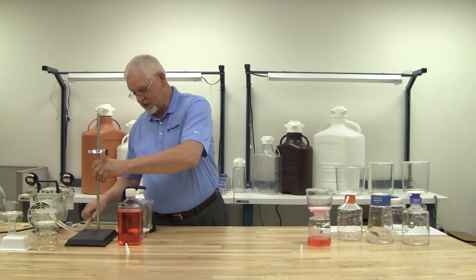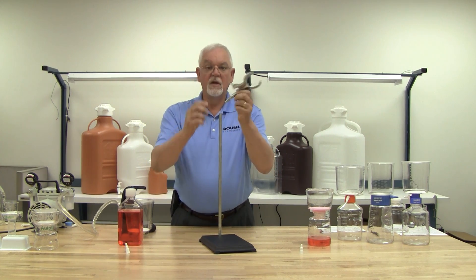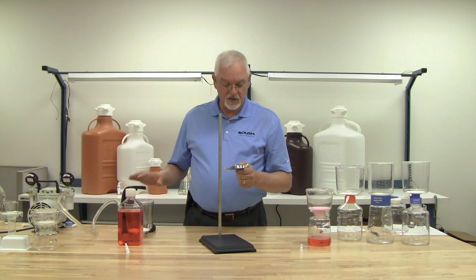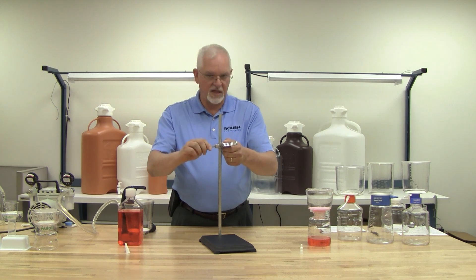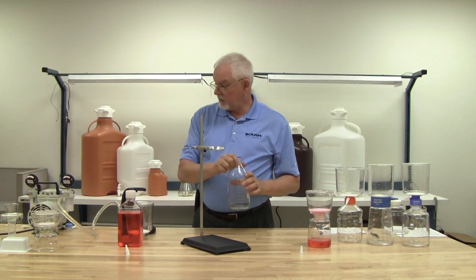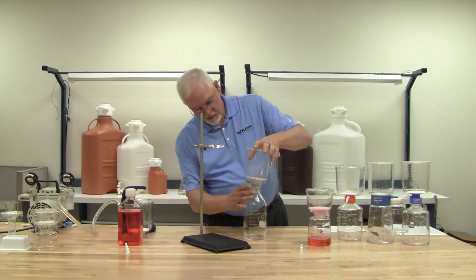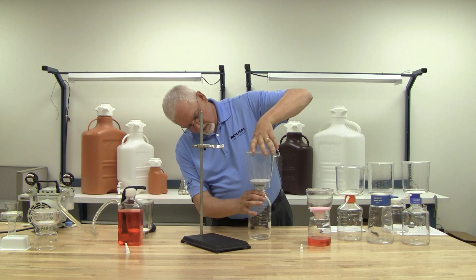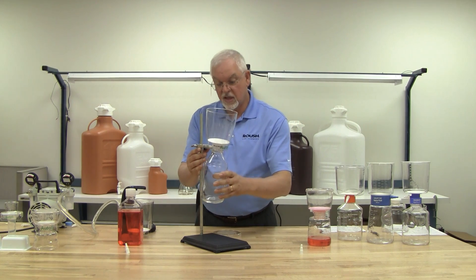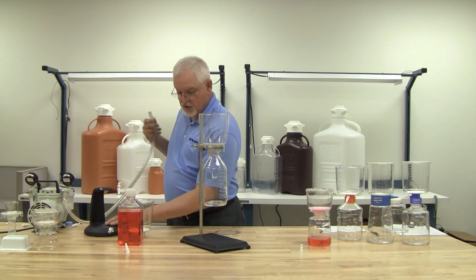The cradle ring comes just like this. It has the same technology as the pedestal, so it comes right down and slides onto any standard lab stand. And if you want to do something like a large glass bottle, it's very easy to do. You would just purchase the funnel only — it screws right on and drops onto the cradle ring, just like the pedestal.